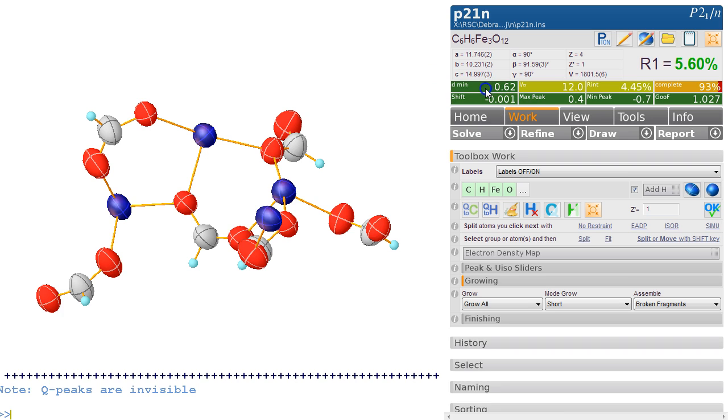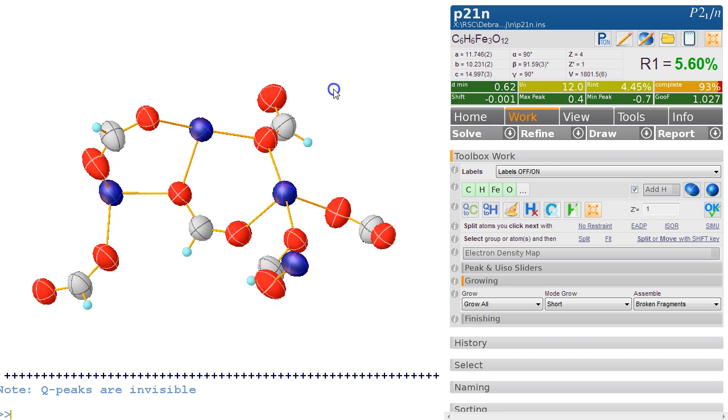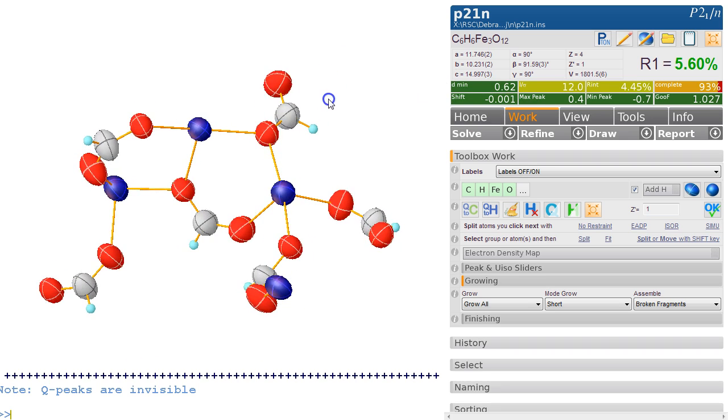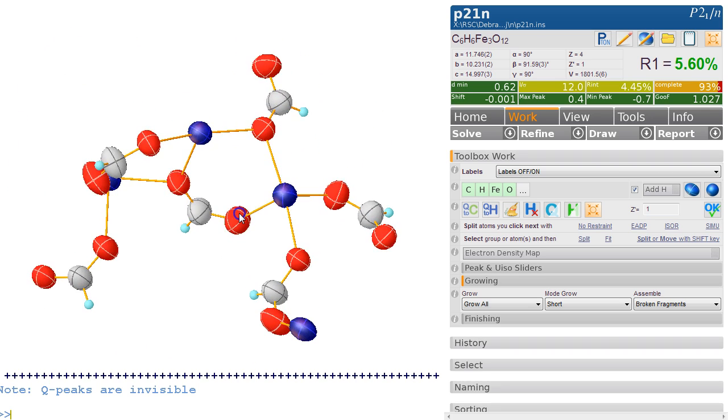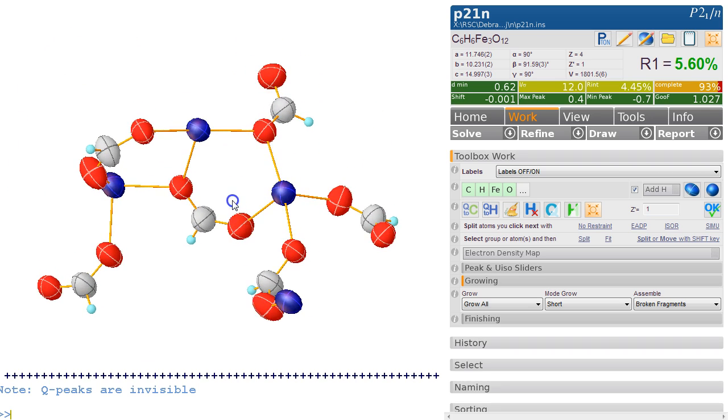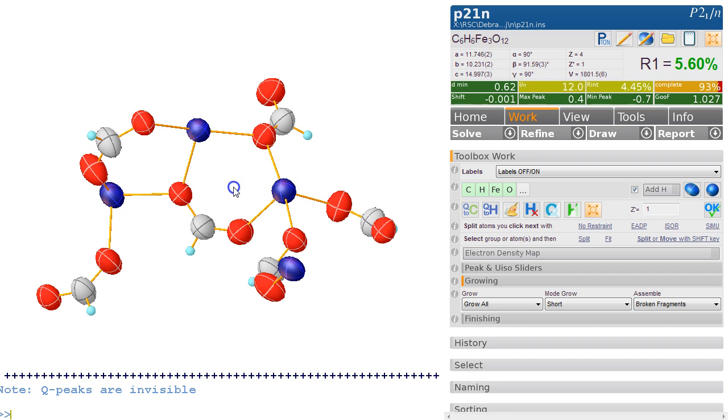The completeness is 93%, but we're going out to 0.62 angstrom. So this is a very high resolution dataset. It looks to me like it's a room temperature dataset—it's a pity. It would be nice if this was low temperature. But the next step, of course, is to make sure in the CSD that this is not known and this is actually a new compound.